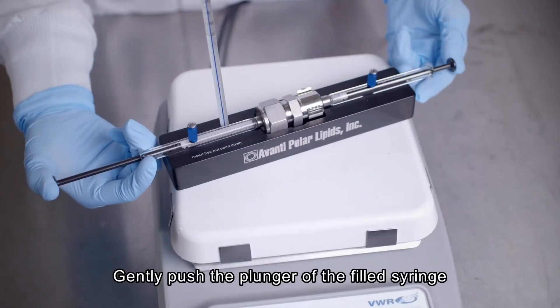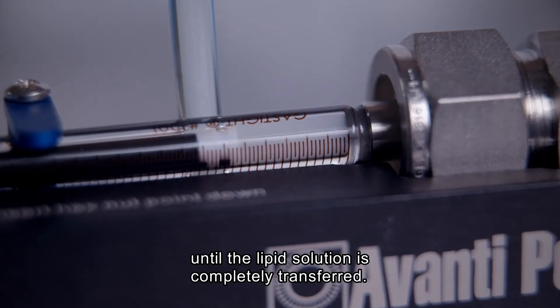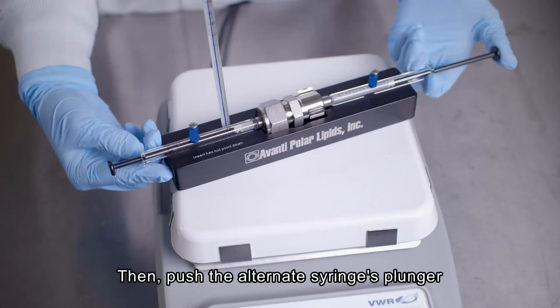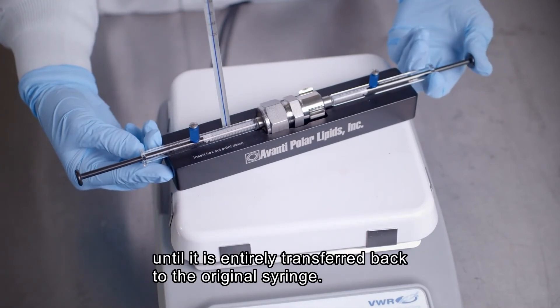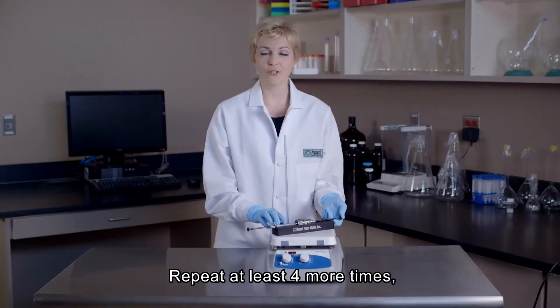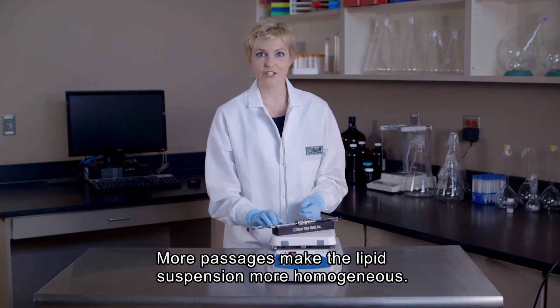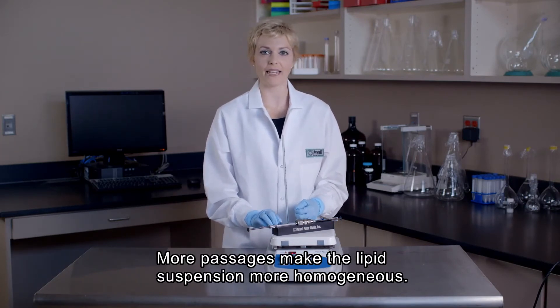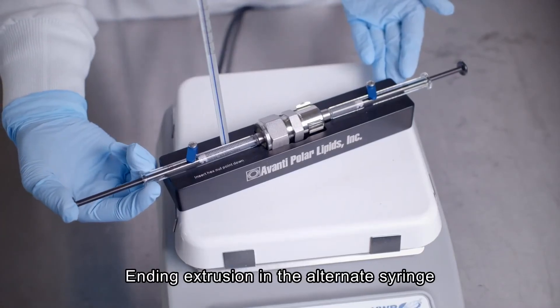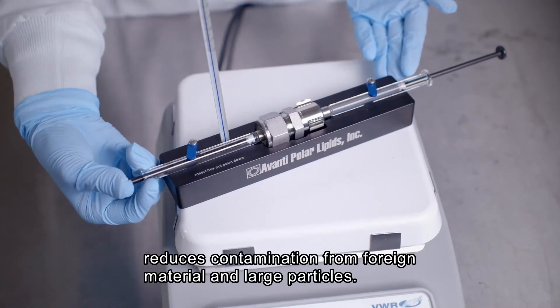To extrude, gently push the plunger of the filled syringe until the lipid solution is completely transferred to the alternate syringe. Then gently push the plunger of the alternate syringe until the lipid solution is completely transferred back to the original syringe. Repeat these two steps a minimum of 4 more times for a total of 10 passages through the membrane. In general, the more passages through the membrane, the more homogenous the lipid suspension becomes. The final extrusion should end in the alternate syringe. This reduces the chances of contamination from foreign material and large particles.